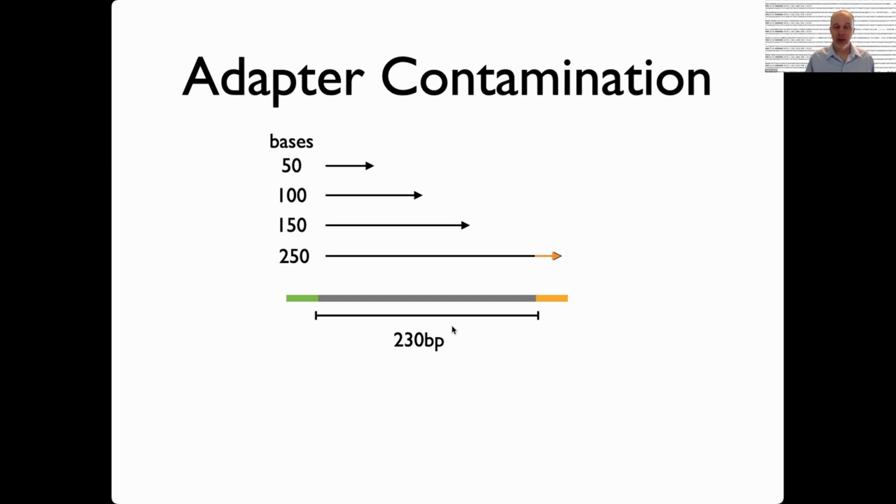Now, of course, we already saw with the library example, when you're taking the sequence and searching the database, this non-biological adapter sequence that comes off the machine as part of the read could create problems in that process. And so often we'll want to remove the adapter.